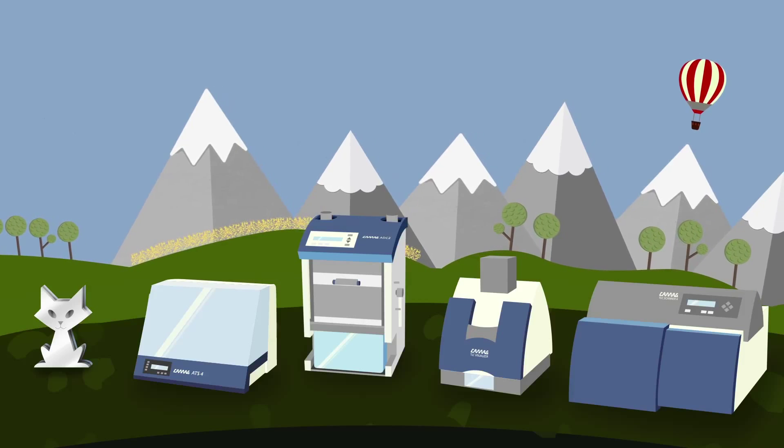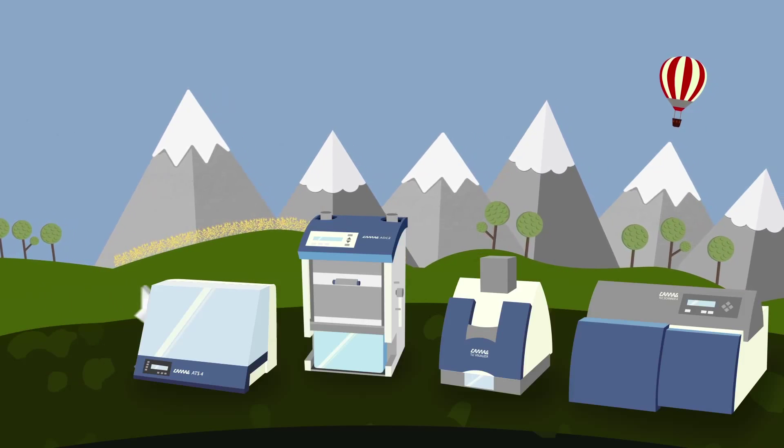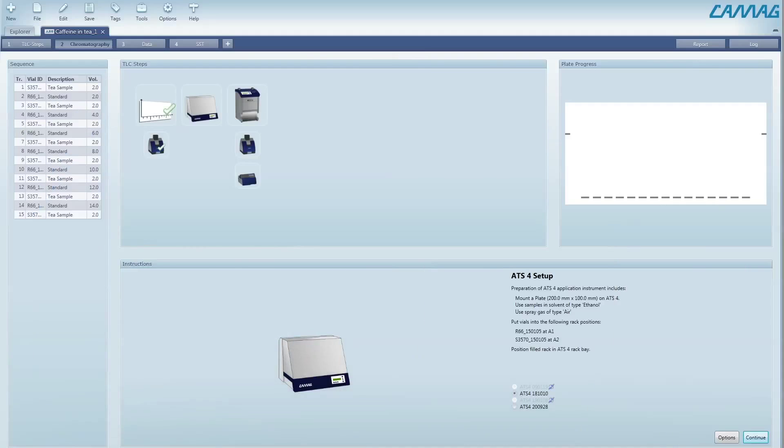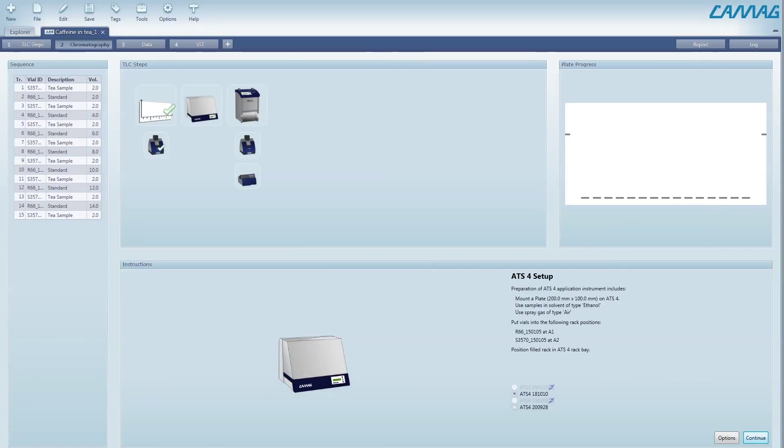VisionCats will guide you through the process. A precise sample application is a crucial factor for the quality of the HPTLC analysis and the results obtained. Using VisionCats together with the ATS-4, a fully automated sample application for routine use and high sample throughput is supported.